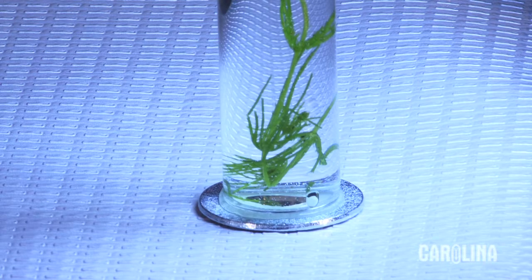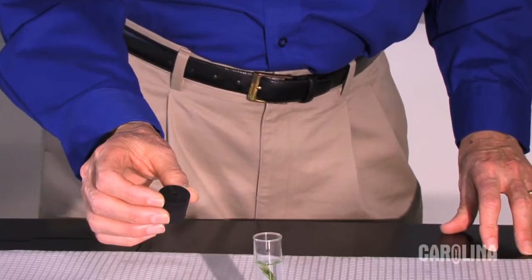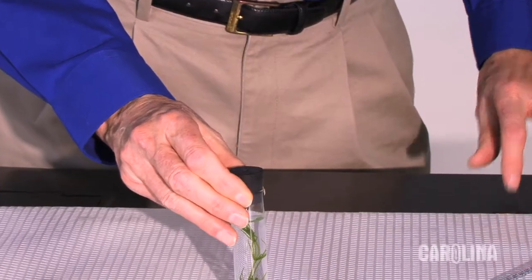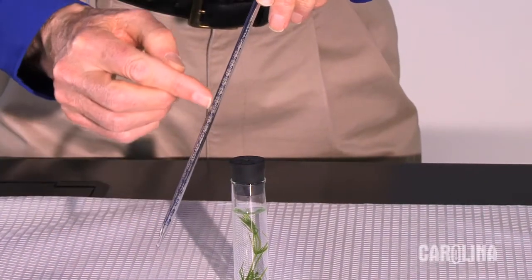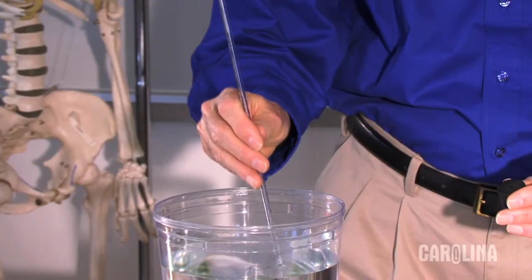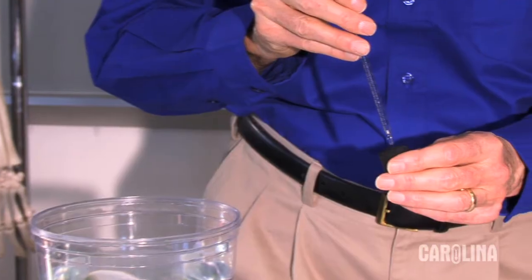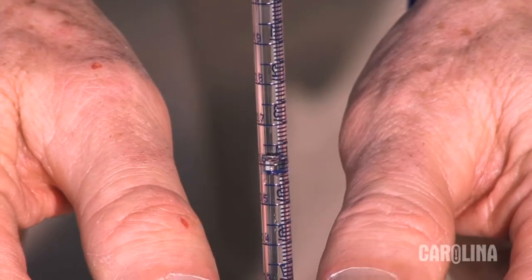We can ramp this up to make it still more quantitative. You will need a one-hole stopper that fits the tube and a pipette graduated to hundredths of a milliliter. Dip the tip into water and insert it into the stopper. Press the stopper into the tube.